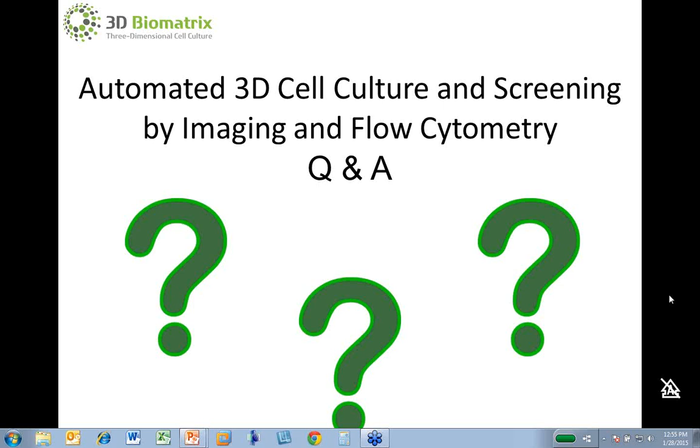Okay, and Nikki, how stable are the drops in the hanging drop plates? I think the videos that Mike showed of the robot moving the hanging drop plates do quite a bit to show how stable they are. There are two things that can grossly affect stability. First of all, sudden jarring movements are never good. Dropping the plates, banging them into things. You can imagine that this is just acceleration and deceleration that a hanging drop just can't handle.